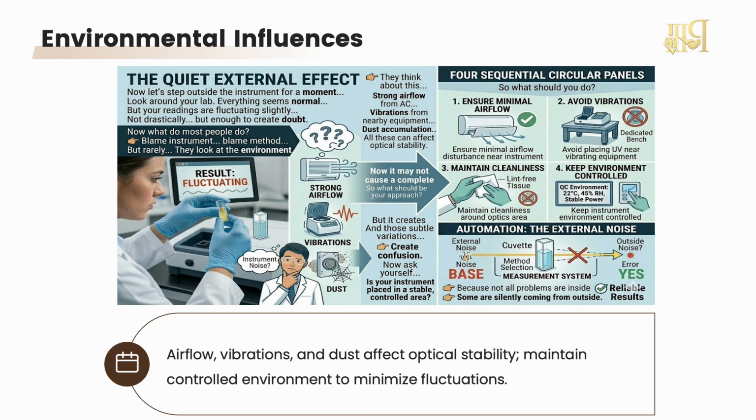So what should you do? Ensure minimum airflow disturbance near the instrument. Avoid placing UV near vibrating equipment. Maintain cleanliness around optics area. Keep instrument environment controlled, because not all problems are inside the instrument. Some are silently coming from outside too.